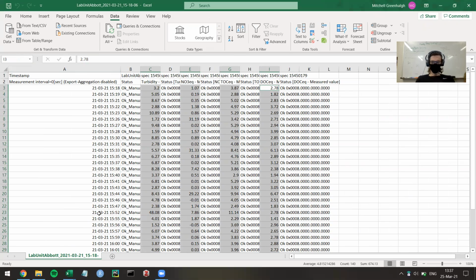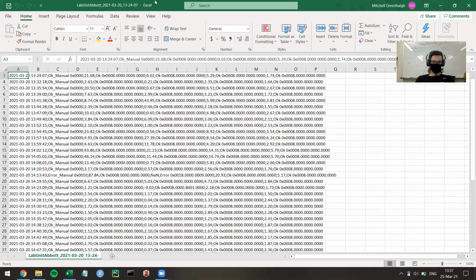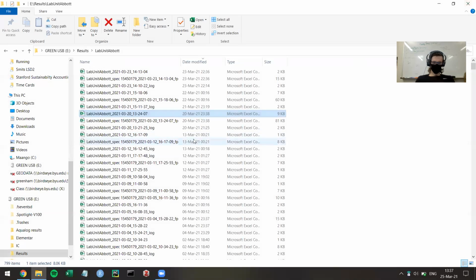Once you're done with the master scan, you saved it and exited out. You can reopen it and double check that everything's saved. Sometimes it does freak out and doesn't save, and it's kind of annoying. It's only happened like once or twice to me, but with this scan document, when you go to exit out of it, you don't want it to save. We want this in its raw data file format. So you hit don't save there, and then this is the old one.